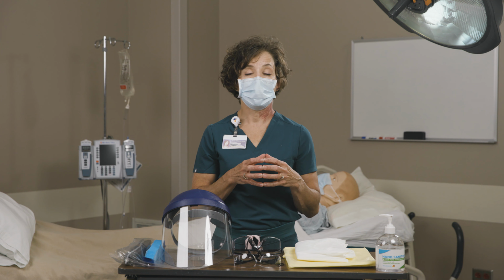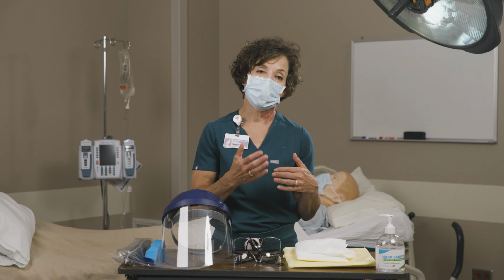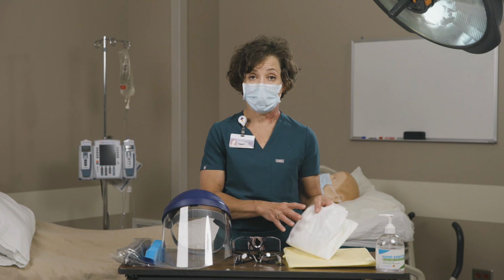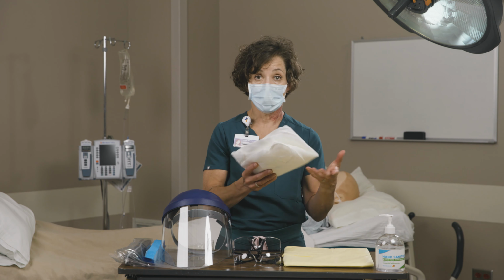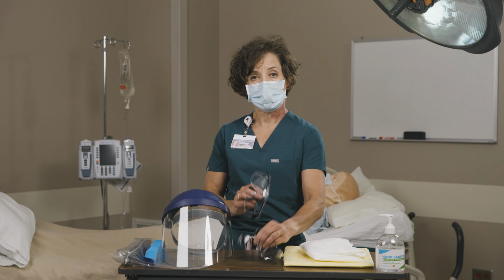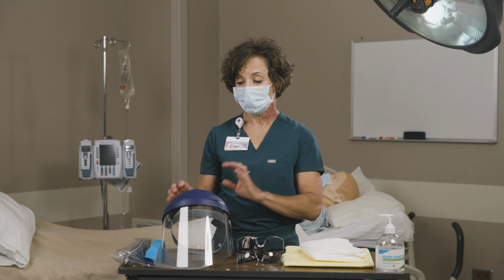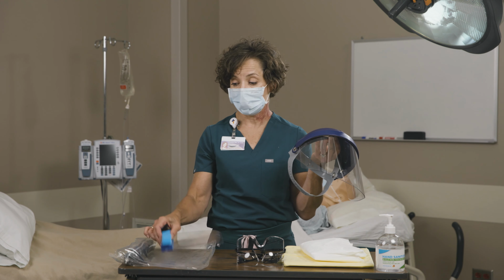Now we want to talk about how you may be seeing different pieces of PPE as we continue to face some supply chain challenges throughout this pandemic. For example, you may see some gowns that are yellow or white or blue. There's several different types of goggles that are available through the supply chain. And then there's multiple different types of face shields that you can use.